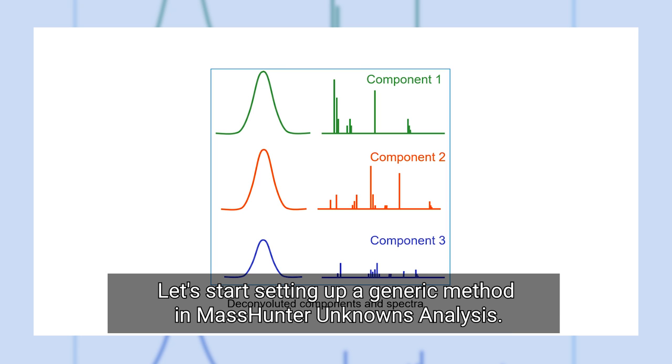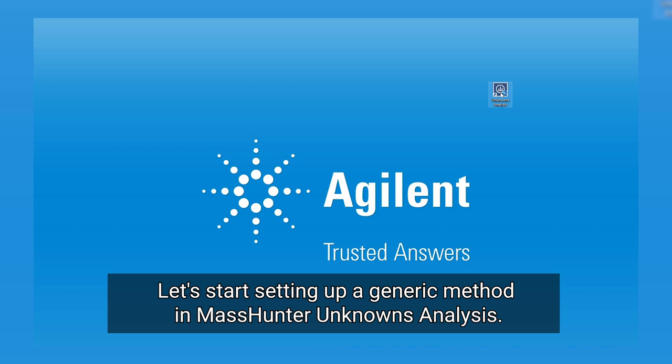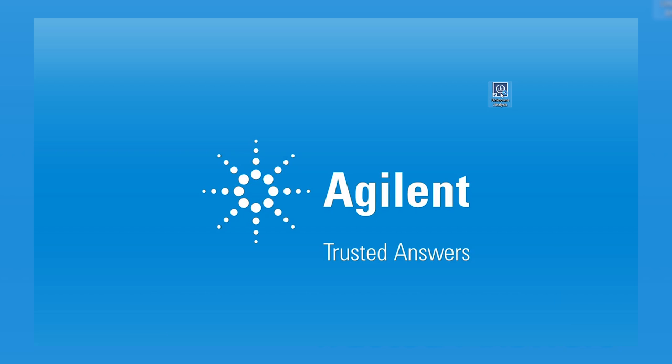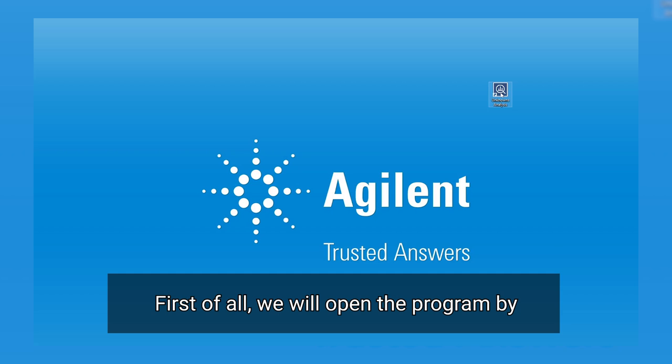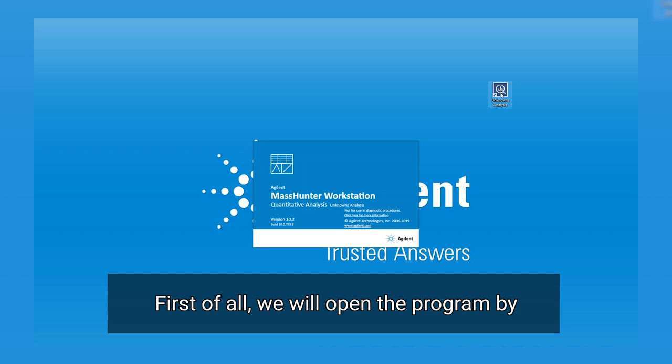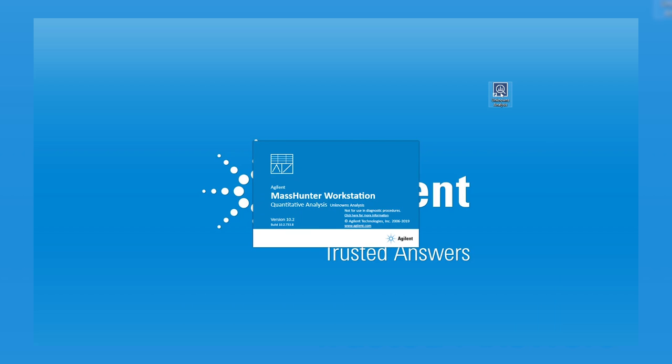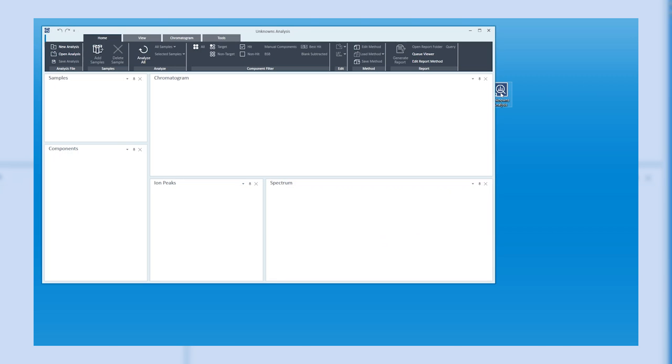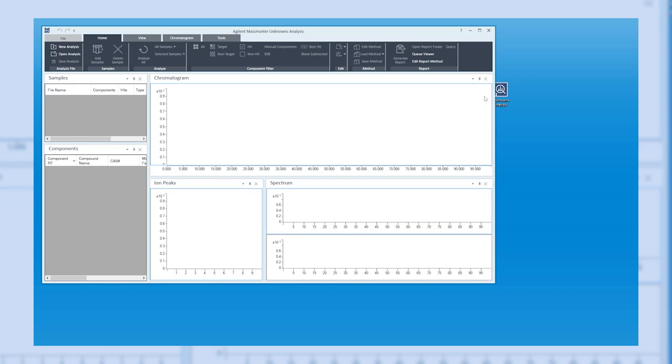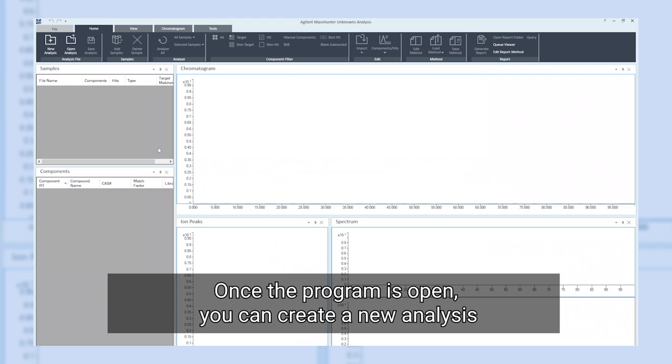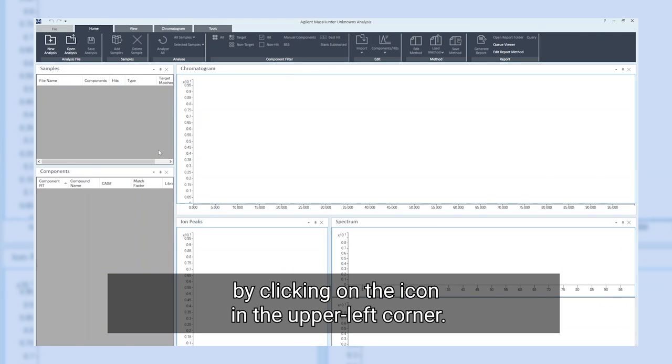Let's start setting up a generic method in MassHunter unknowns analysis. First of all, we will open the program by double-clicking on the icon.